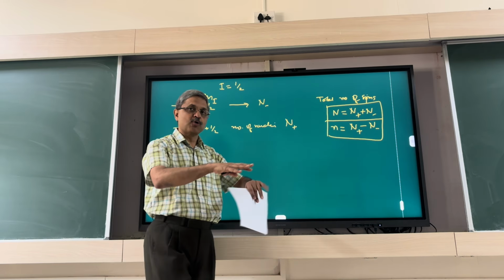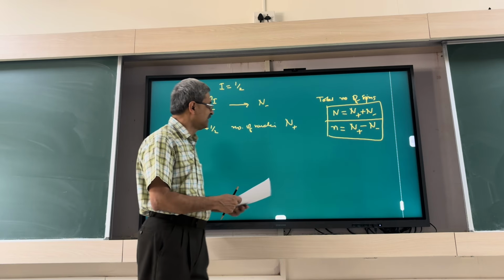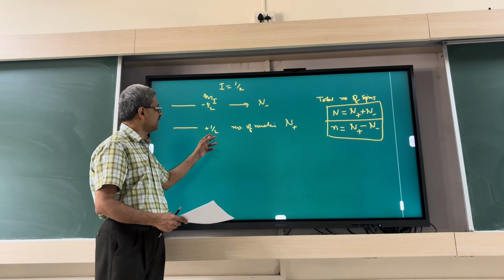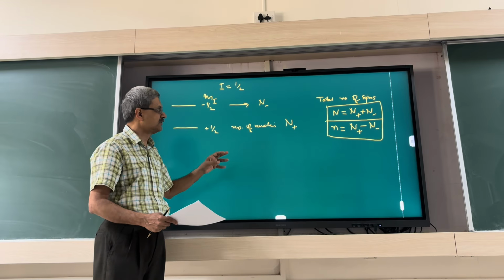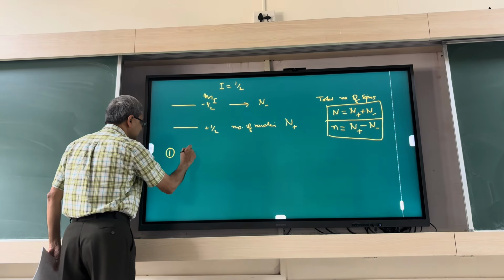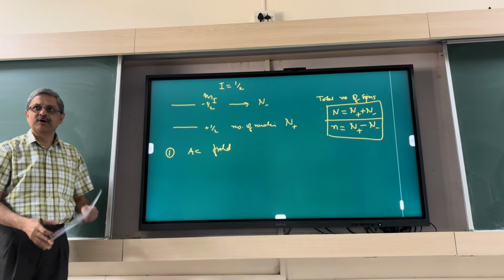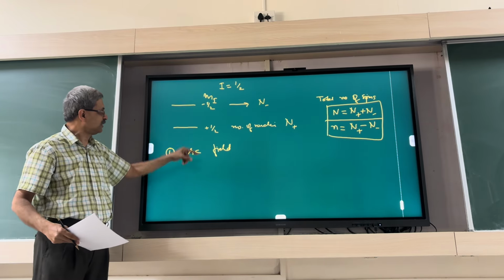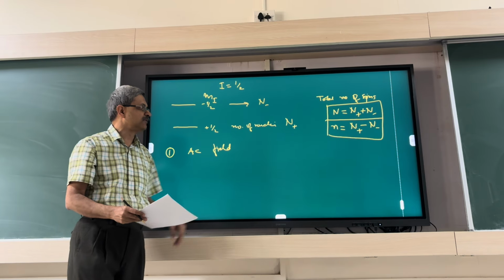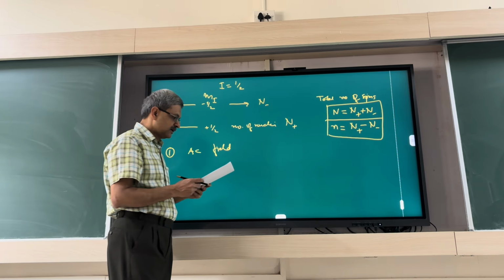But also you have the so-called lattice present. If there is an interaction term with the lattice, then you will get some transitions between these states, okay? So we'll consider both of them, but first we just have an AC field. Right now we are not talking about the lattice, we're just looking at transitions between these because of the AC field. Later we'll put the other one also, since a real experiment is finally a combination of the two.